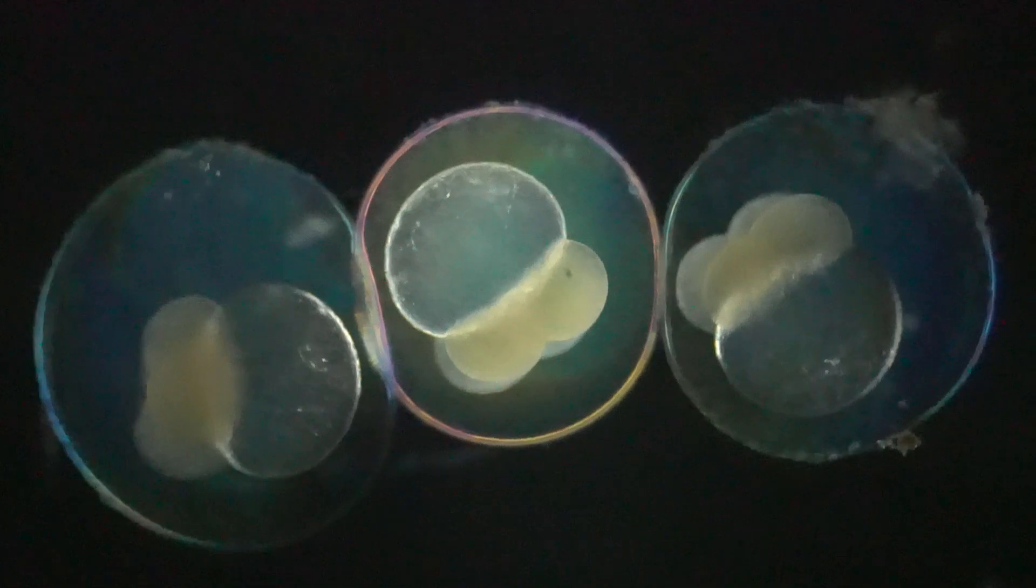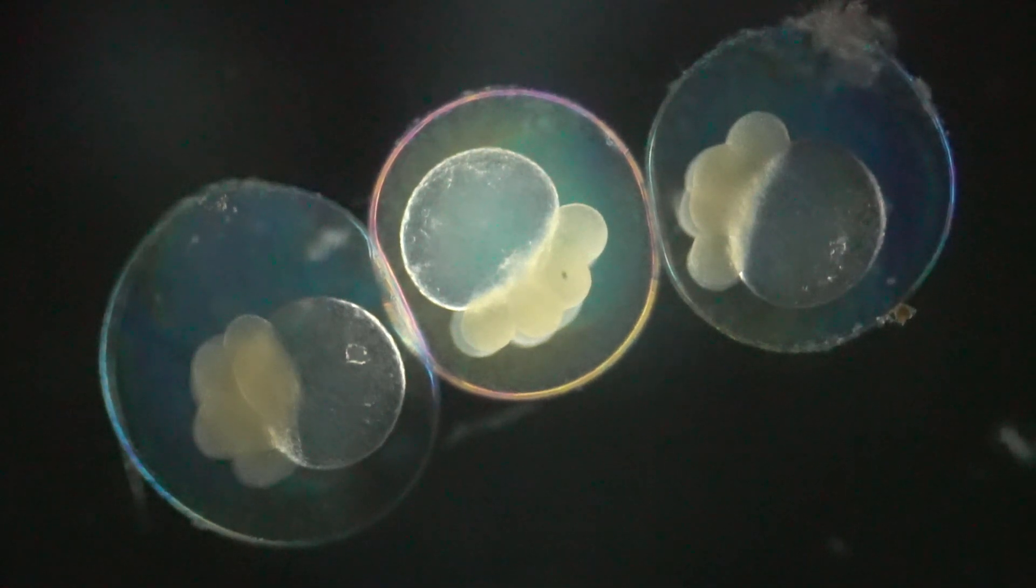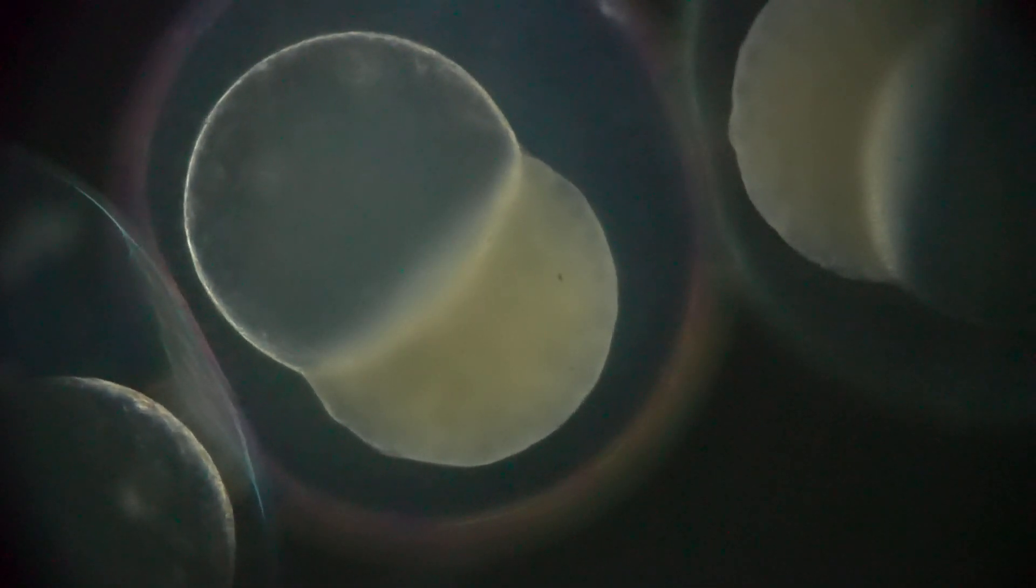It starts out pretty slow from two, four, eight, sixteen and then it really starts to pick up in speed. Now eventually there will be so many cells you really can't decipher one from the other, and up until this point we're looking at about 512 cells or so. Each one of these cells has had a cytoplasmic connection with the ovum up until this point.